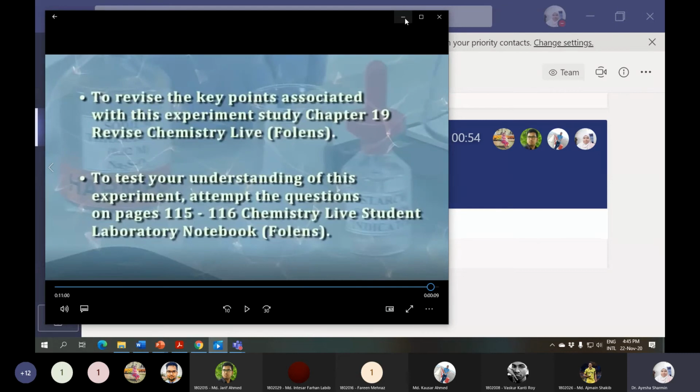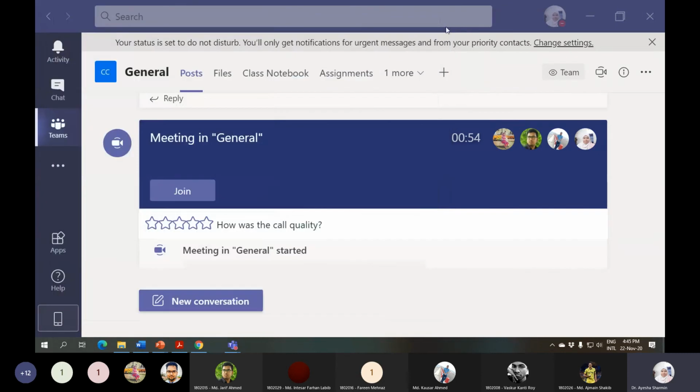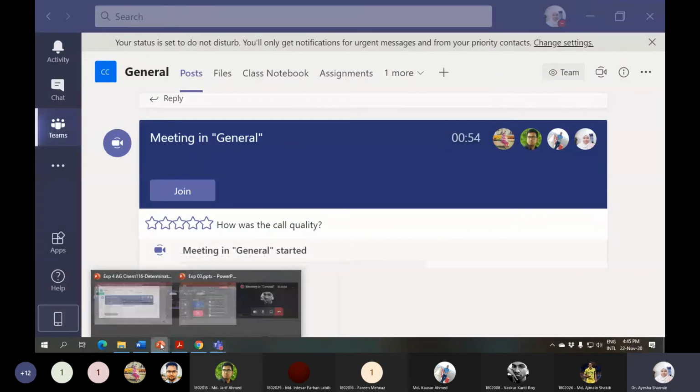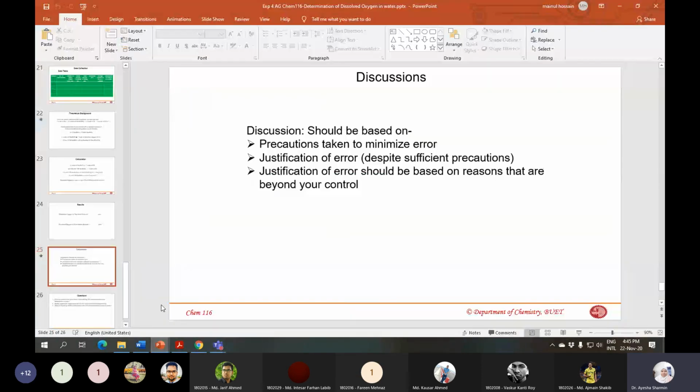Now, if you keep that bottle, the stopper not closed but open, what will happen is that with time you'll see the light brown color become darker and darker, because it can now take the oxygen from the air and can liberate more iodine.